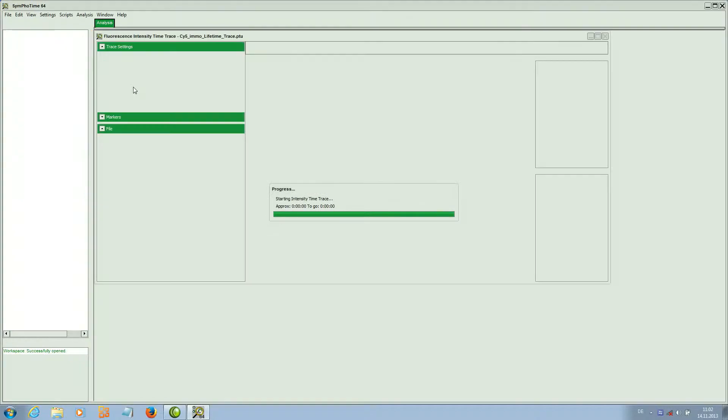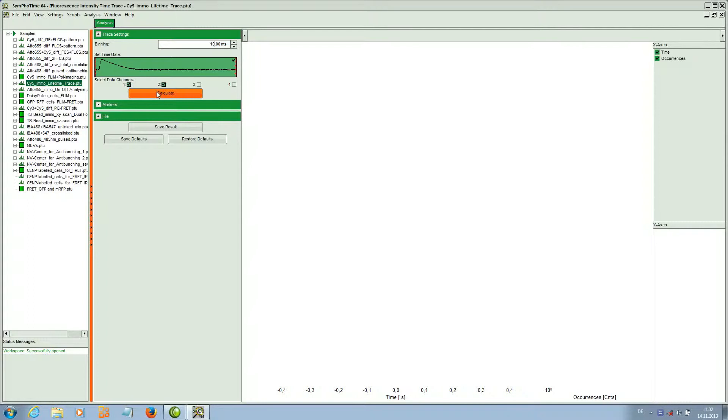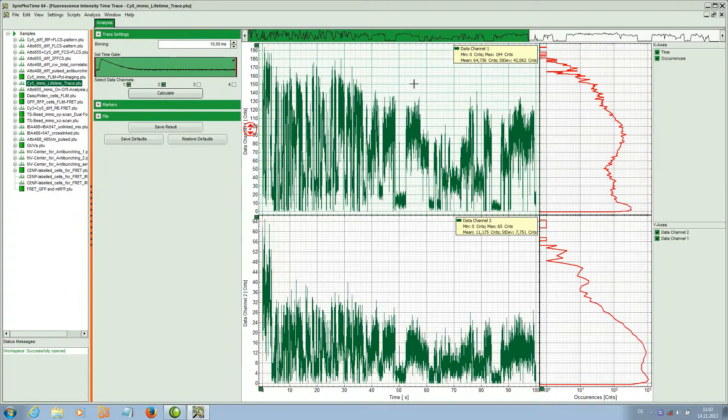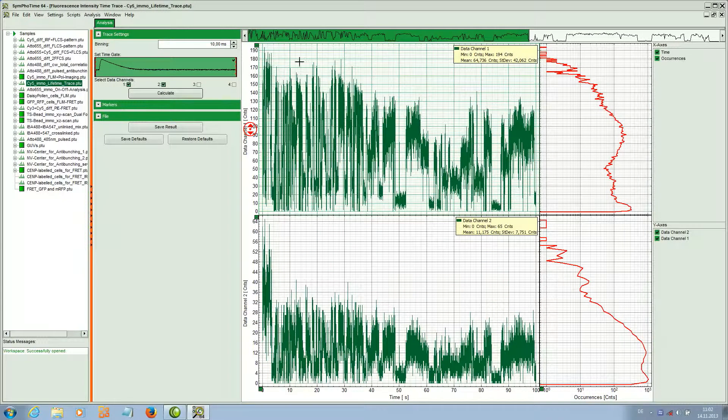Start the intensity time trace and we see here in the parameter area we can choose the time bin width. This is in this case 10 milliseconds per time bin. We have two spectral channels. When we calculate we get two different time traces for each channel.